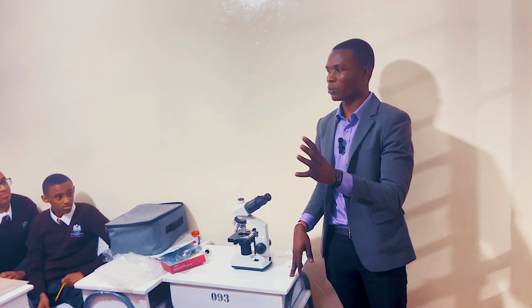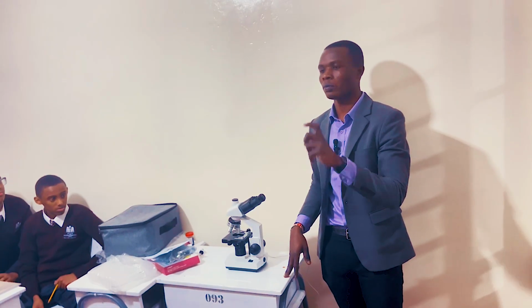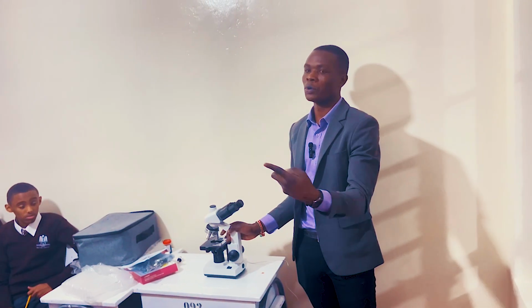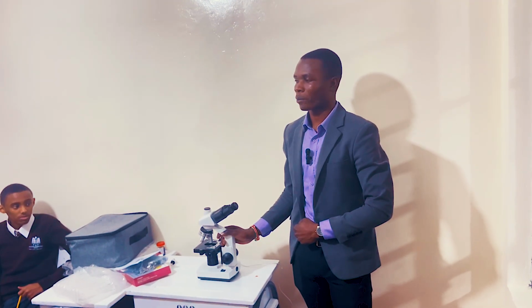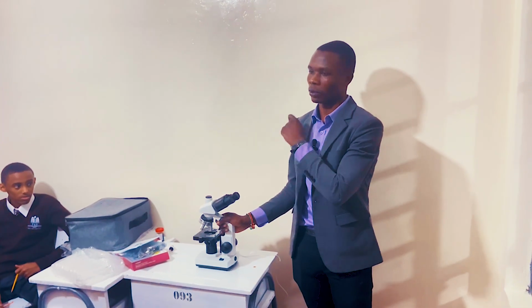We talked about animal cells and plant cells. So with our naked eyes, we cannot be able to see the internal cells in organisms, right? But using a microscope, we can be able to see the cell organelles, so that when you talk about a mitochondria, you can be able to see it under a microscope. Is that okay up to that point? Good.